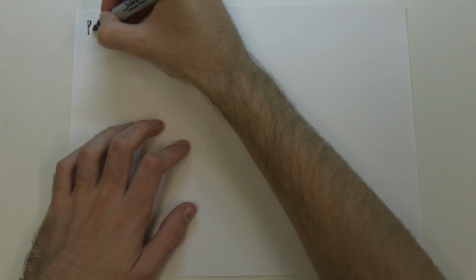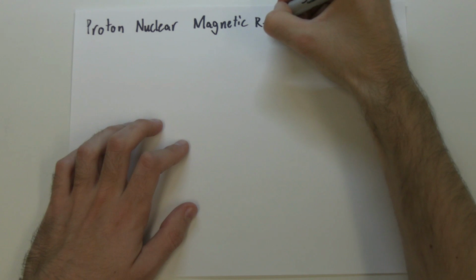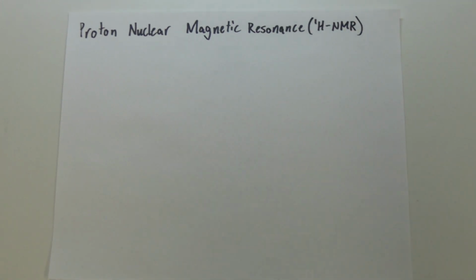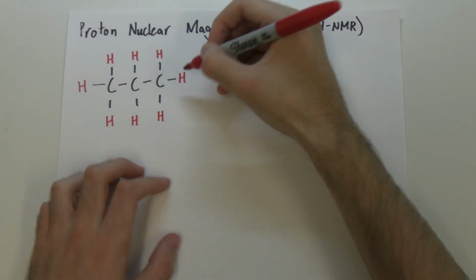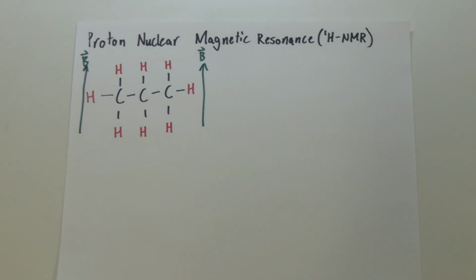Now that we have all that background, the basics of NMR should be straightforward to understand. To simplify, we will only look at proton NMR, where we are only really looking for the spectrum of hydrogen groups in molecules, since C12 and O16, as the most common isotopes, are NMR silent. Say we have this molecule of propane and want to look at its NMR spectrum. We will first put it in a steady magnetic field to split the energy levels. Each group will have different splitting depending on their nuclear shielding.